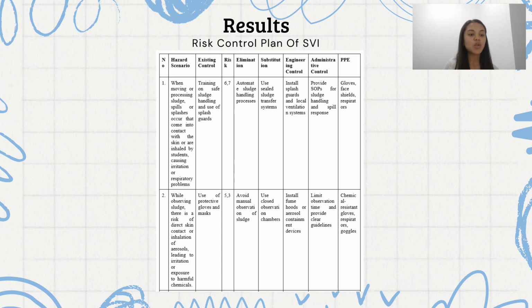And the table also discusses the risks associated with using glass containers to transfer sludge because they can shatter and injure people. For safer handling, it is advised to move to non-glass or shatterproof containers. Maintaining orderly workspaces and implementing routine housekeeping inspections are advocated since cluttered work environments increase the danger of unintentional spills or falls. So that's all from me.